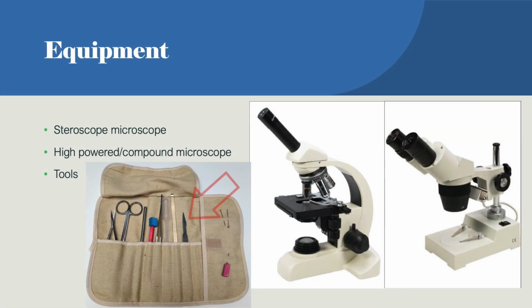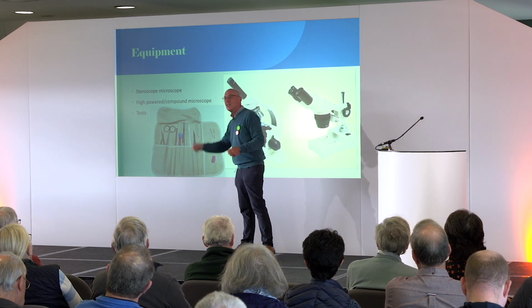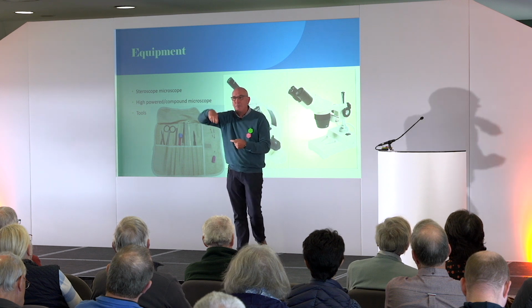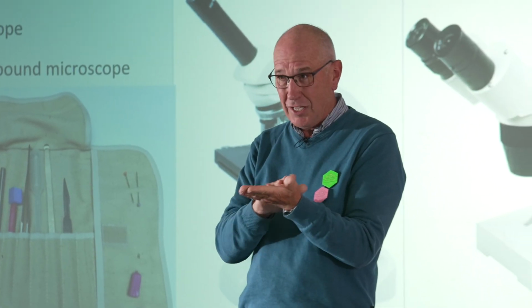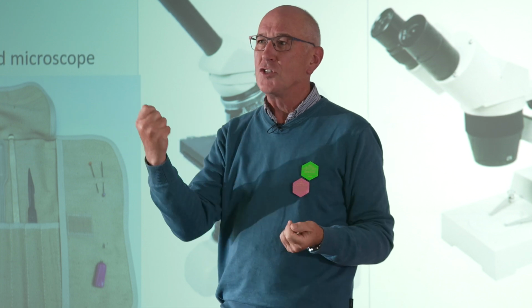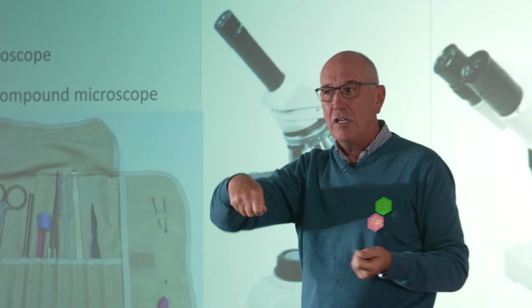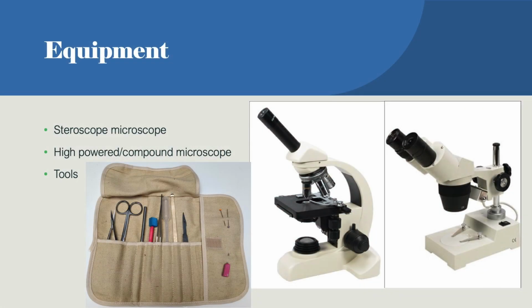You have to have a scalpel, and for a scalpel you have a number 3 handle and a number 11 blade, because you want to have it as pointy as possible. So when you're cutting things, you want to make them fine. Some of the kits I see, which you can buy off the shelf, have butcher's knives, and you're never going to get into any detail with those. But the most key part is what I will talk about as a seeker.